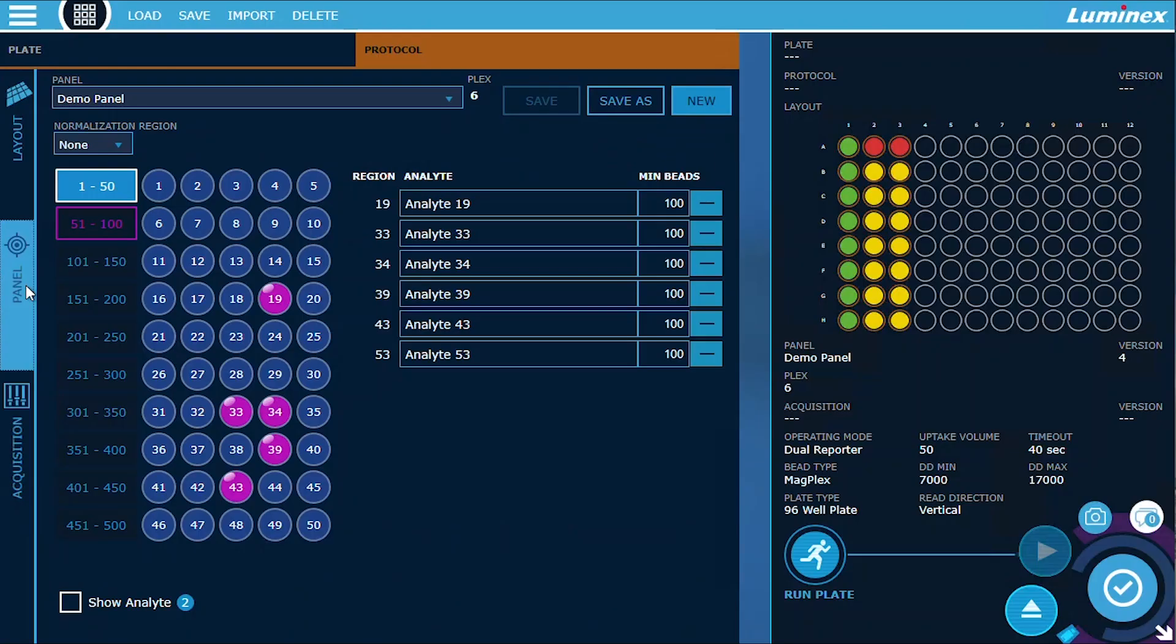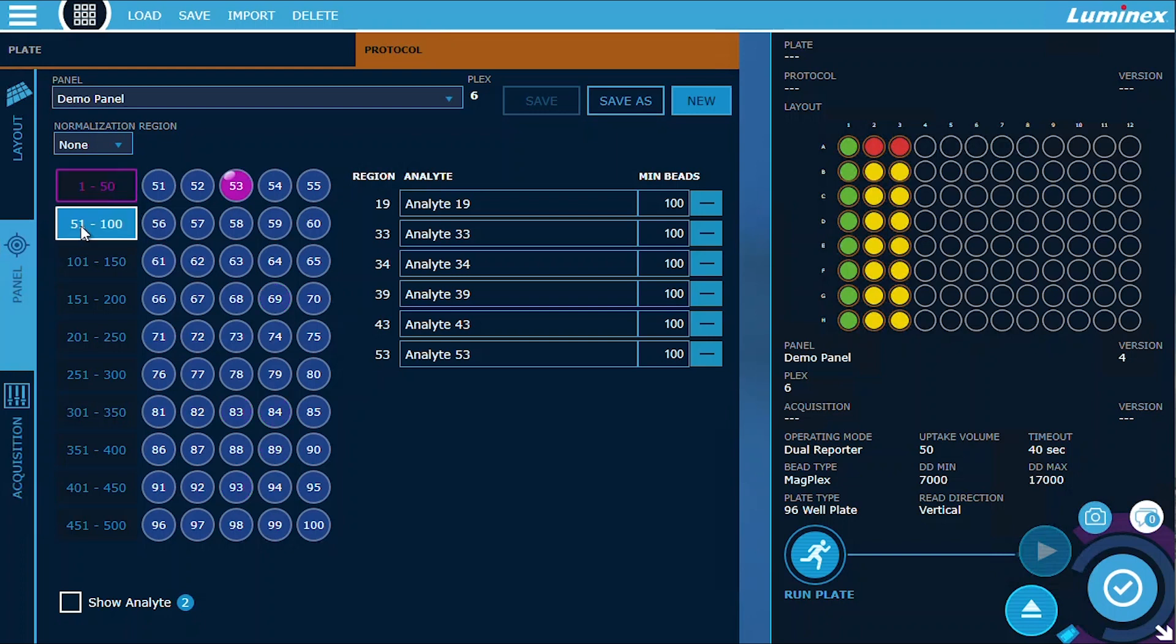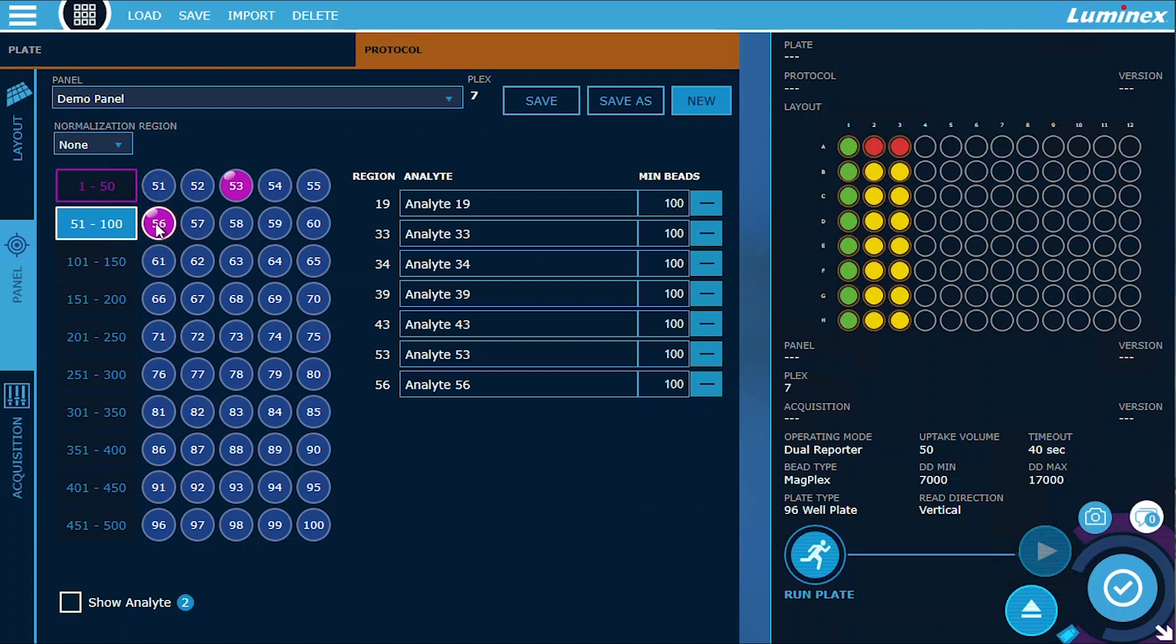Panel. On the panel page, we made a few changes. First, we introduced a new graphical interface that simplifies the process of selecting bead regions. With just a few clicks, you can effortlessly navigate and choose the regions you need for your experiment.